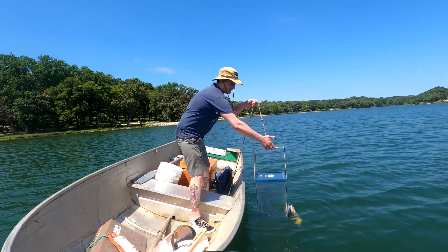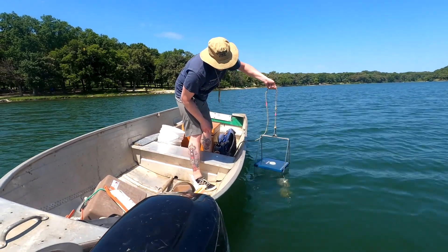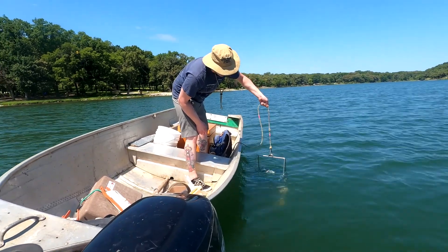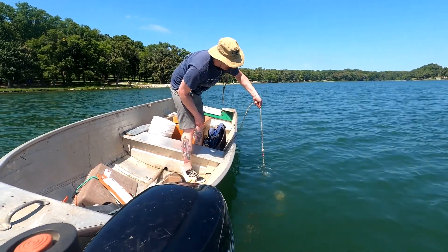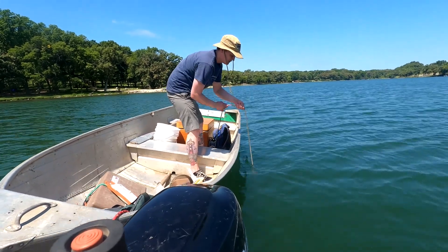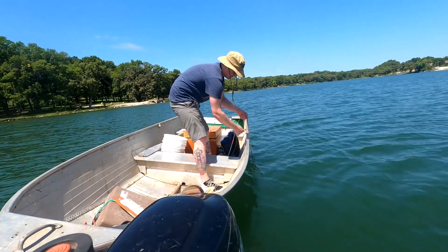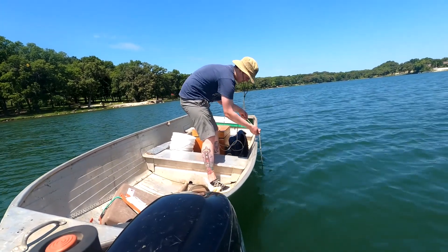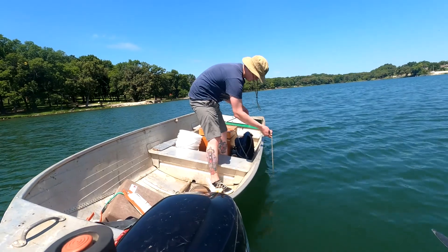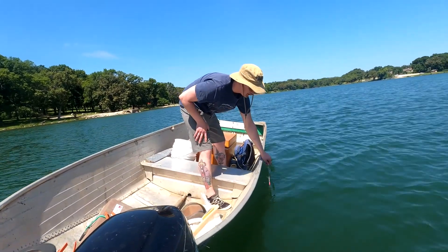So we're going to go ahead and lower it in. Hopefully you can see that door opening up, and that second one a little bit. We're going to lower it down to five meters — there's the five meter mark. I'll stop here.